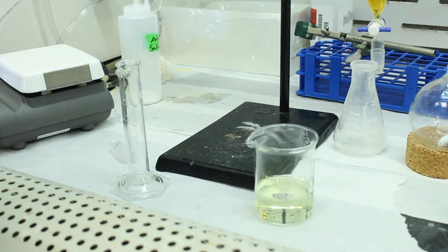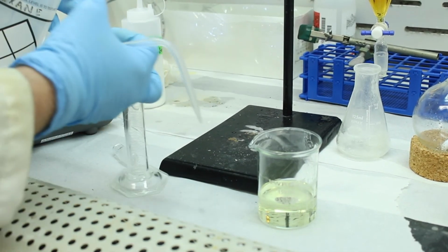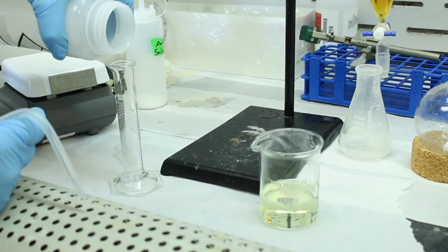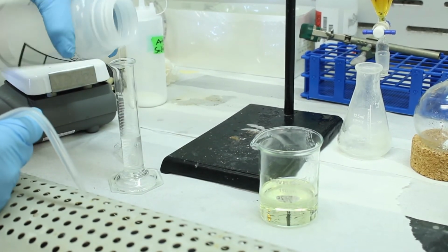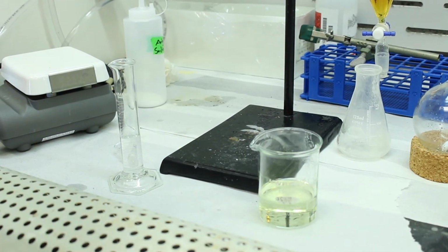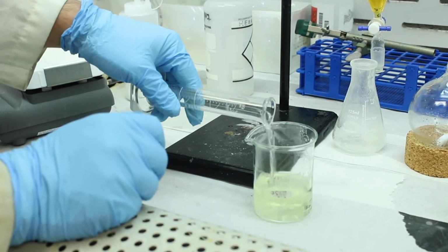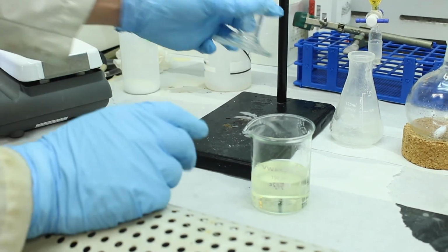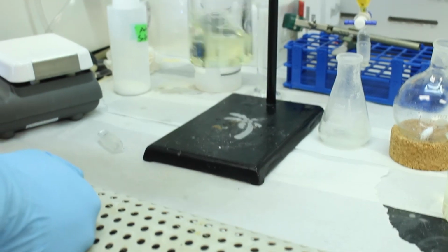So I'll just pour some out. When I add the hexane to the beaker, the solution should remain homogeneous. I'll add around 10 mLs. It should remain homogeneous, so everything should remain in solution when I first add it here. So I can add the hexane. Yeah, homogeneous. And hexane and diethyl ether are miscible, so they mix.